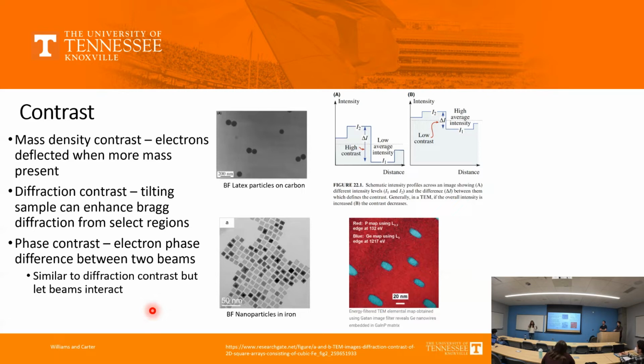Intuitively, when you look at the diffraction pattern, for coherent precipitates, your lattices are oriented with a slight relationship to each other in terms of your diffraction pattern. Otherwise, you would not have coherence. So what do you think? It's getting more difficult as we progress with this class now.